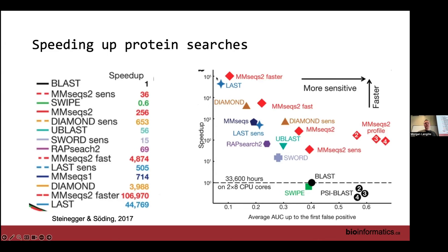And then they'll add in other steps where they say, well, maybe we should add in genes that we think are there because of the step before and after, and maybe they just don't have sequencing depth. This is where it gets into the basic step of finding the gene, and then the pathway mapping is definitely a bit more of an art. Essentially, when you're looking at the bare bones genes in your functional annotation system, it's very easy to understand how that number equates to your reads. A read maps to a gene, that's a count. But when you're looking at pathways, depending on your system, it's not quite as interpretable.